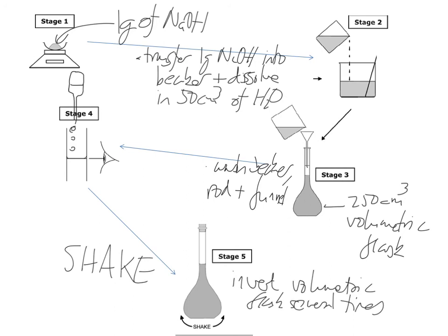So, measure your mass of sodium hydroxide, one gram, exactly. Transfer that into a beaker. Wash the weighing boat. Dissolve it in about 50 centimetre cube of water. Wash the weighing boat. Then tip the liquid from the beaker through a funnel into a volumetric flask. Rinse the beaker. Rinse the glass rod, obviously through the funnel. Then rinse the funnel. And then for your final topping up of the liquid line in there, use a pasta pipette. Stopper the volumetric flask and shake. And that should be how to prepare a standard solution.